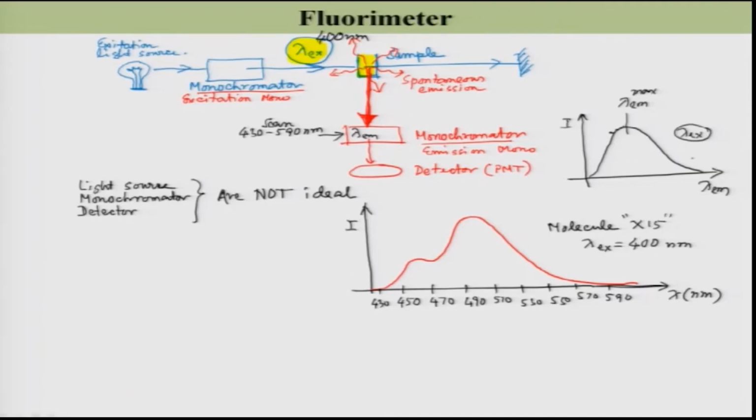If you do not do anything and you just go and purchase a fluorimeter and do this experiment and simply plot it, I will show you how the plot will look like. Just let me change the color, let me take this green. So, if you plot it, what you are going to see is like this. If you do not do anything and just simply plot, you are going to see it this way. That means, this is your measured one, and this is your actual one.